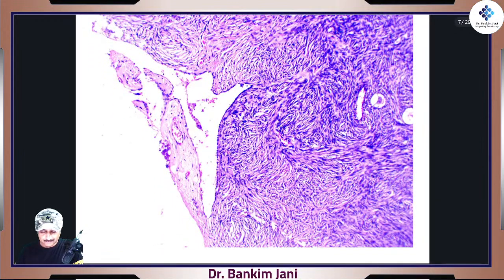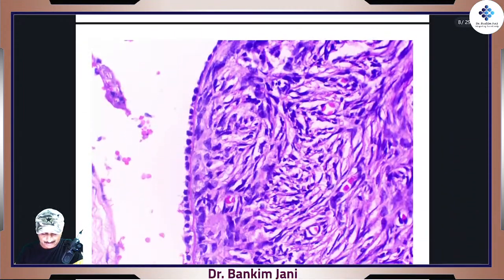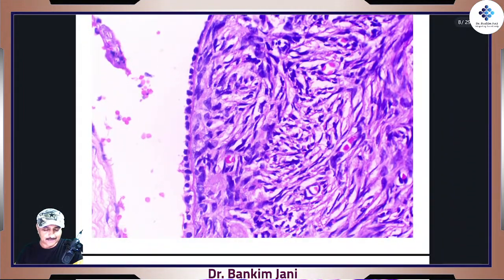Okay. Watch for these areas. See, beyond doubt, right? I need not explain anything. See how nicely you can see that these are the nuclei which are big one, round, right?